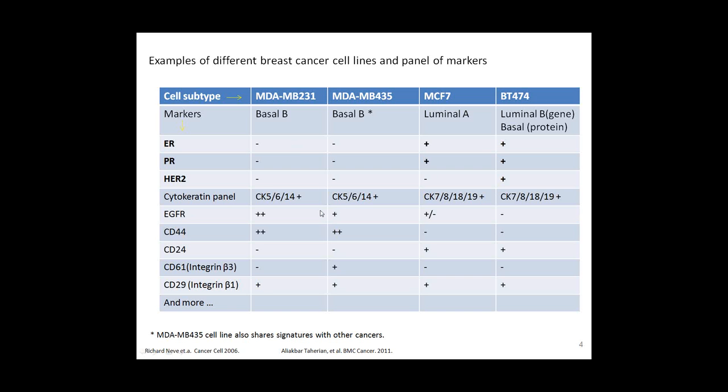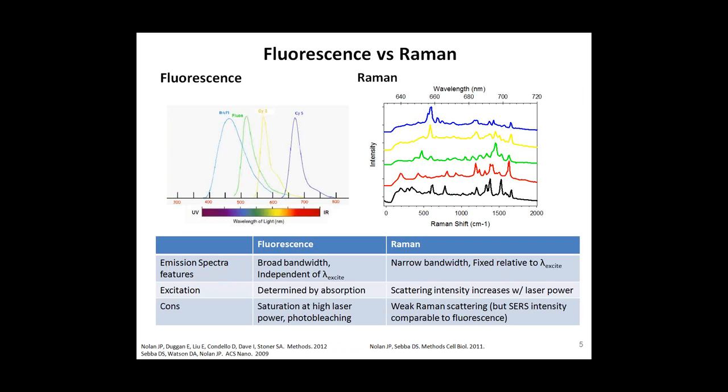So naturally, one of the questions that come to mind is how can we stain the cells or look at the different cell lines that are stained with 12 markers? Is it possible? And naturally, we are looking at fluorescence staining. In image cytometry, we know that the hardware is one of the limiting factors to look at, for example, 12 channels at one time.